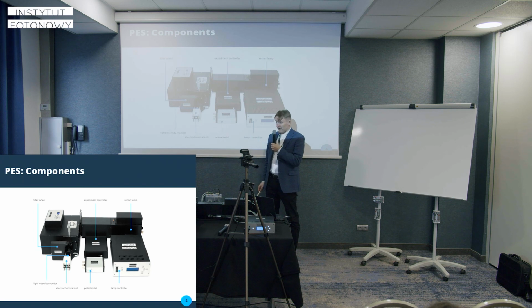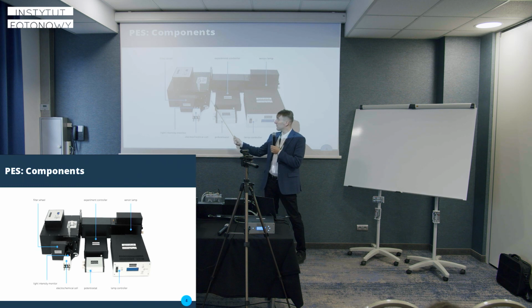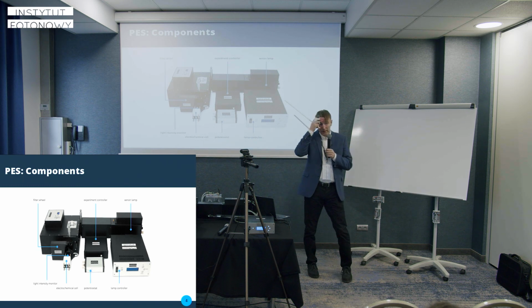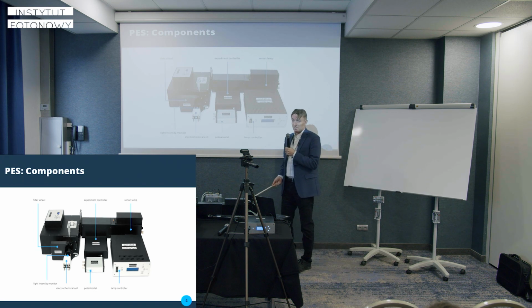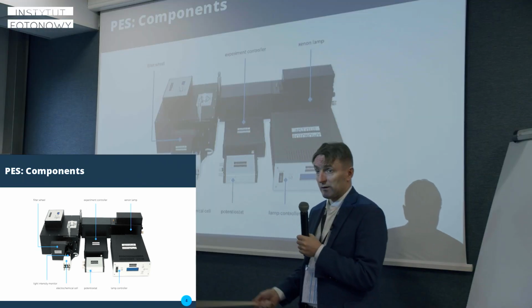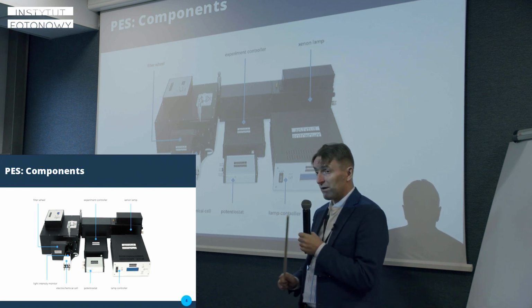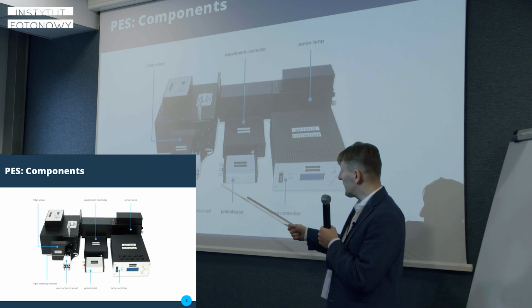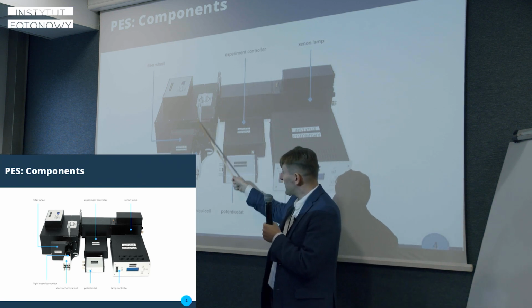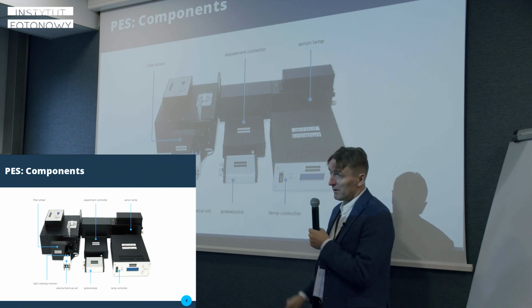And you place your sample. If you measure low currents, you need to enclose it in some kind of Faraday cage or ambient light shield, because the distortion coming from stray electromagnetic fields will hamper your signal. And well, so this is the light delivery system, and for measurements we use a potentiostat.